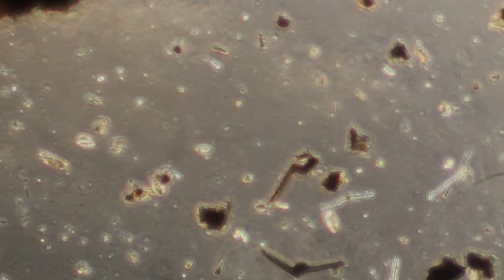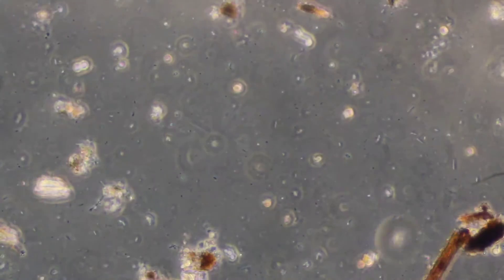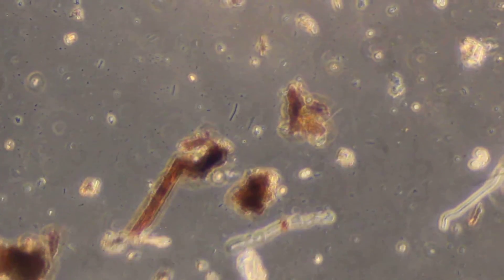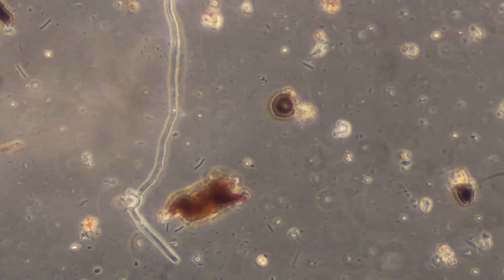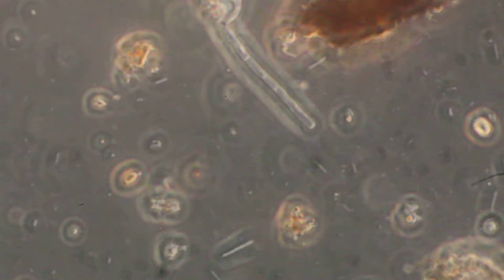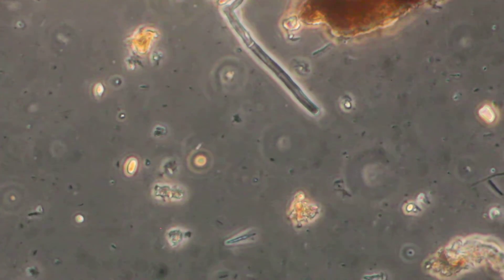So if we just zoom in here — they're going to flagellate. I see a lot of bacteria cruising around. Oh, there's another fungal strand starting up. And if we zoom in a little bit further, 400 times magnification, there you can see what's really going on.